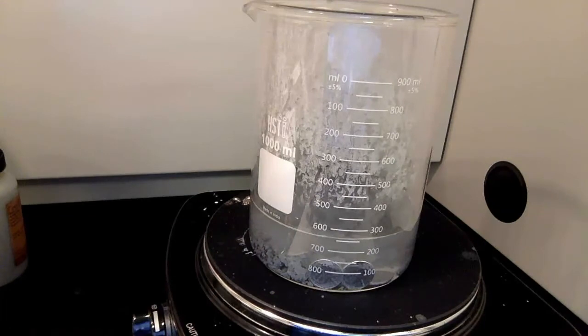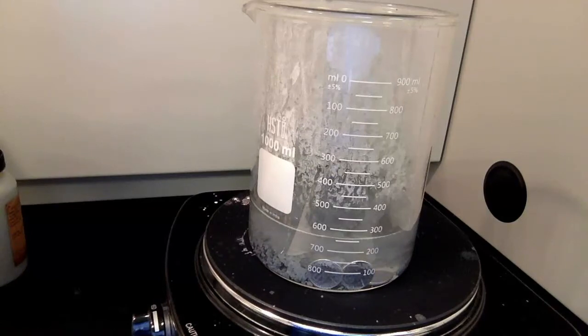Now, it's important to note the copper hasn't gone anywhere. There is still a layer of copper on this penny. But in this case, what's happening is that zinc is covering the copper on the penny. So now we have a layer of zinc surrounding a layer of copper on this penny.